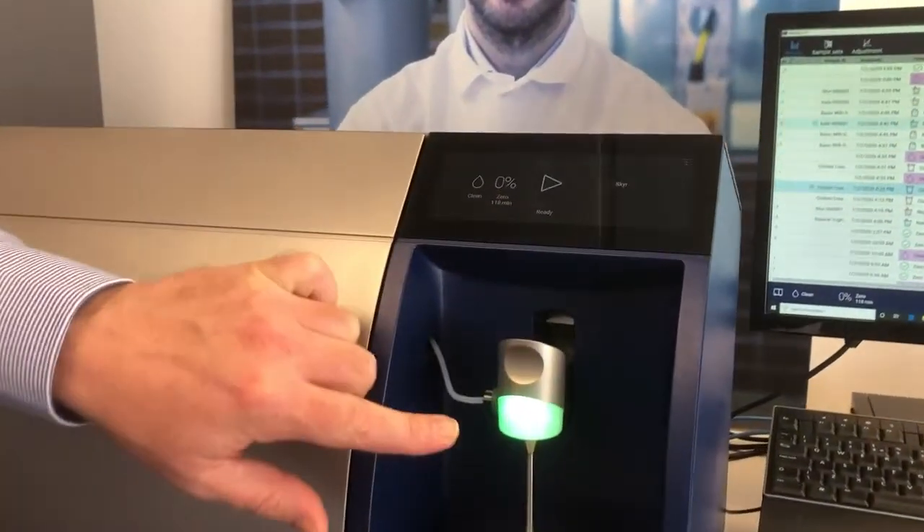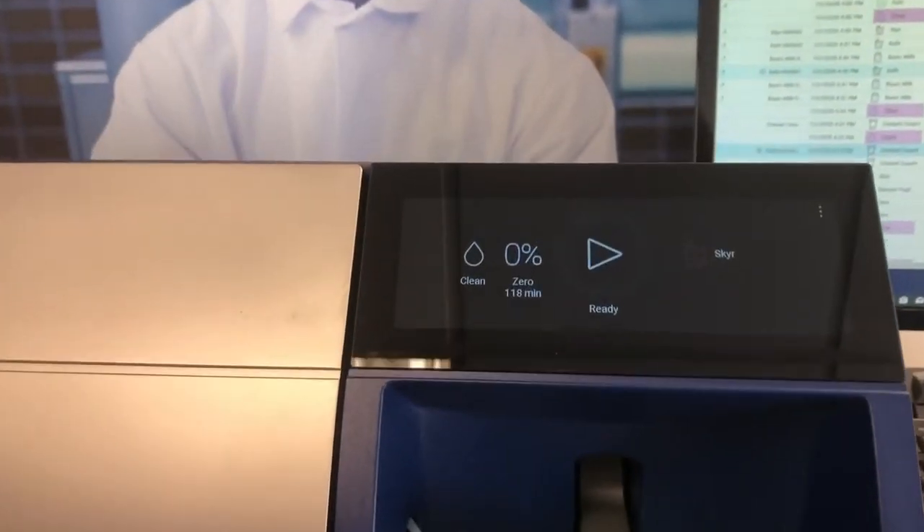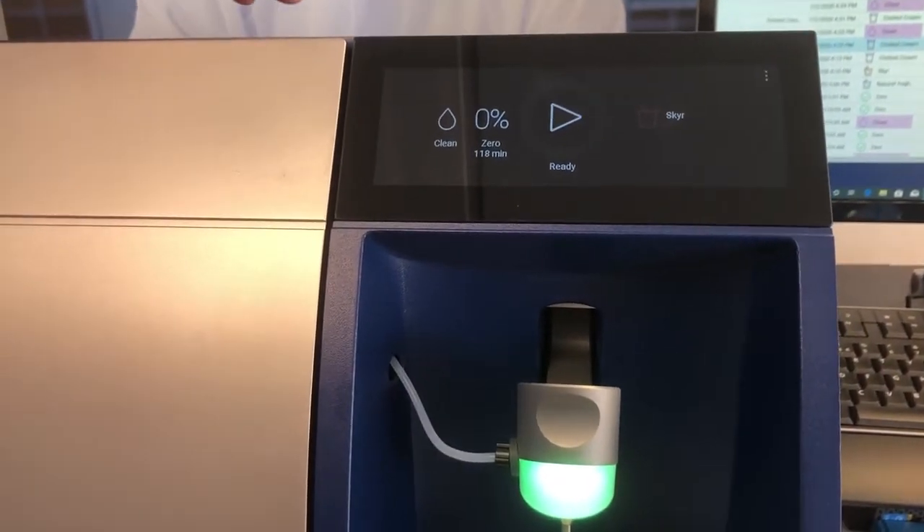The new pipette has a coloured function: green means it's ready to take a sample, orange means it's during the process of analysing the sample, and red means there is an issue.